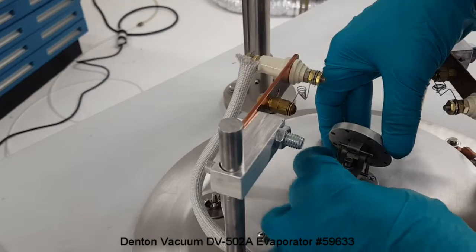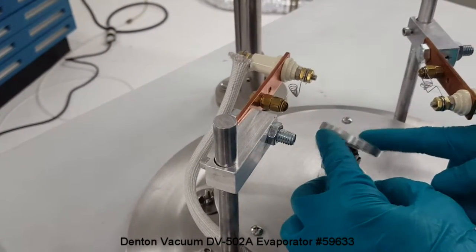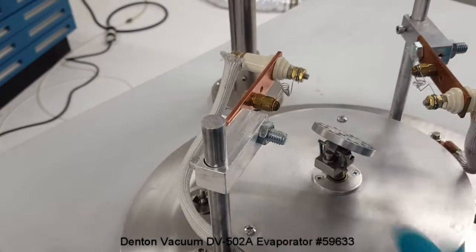By raising this screw up, we can adjust the angle or the tilt of the sample holder.